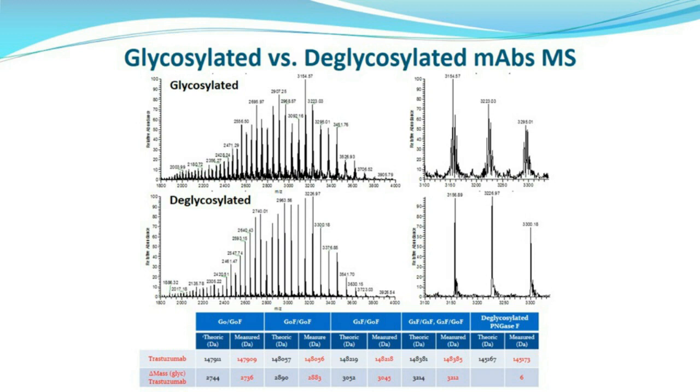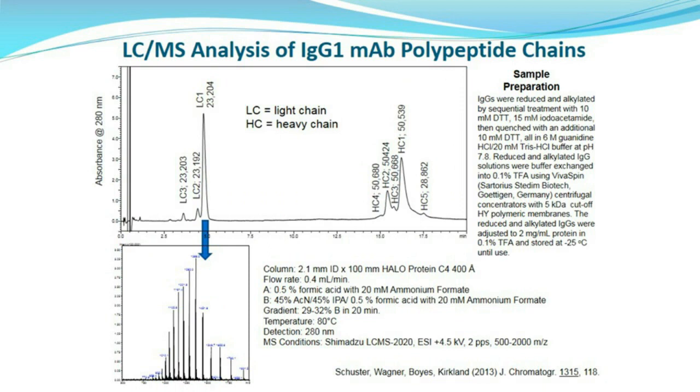Just want to quickly indicate that even though we've really focused on the use of this for peptide analyses and intact IgGs, of course exactly the same alternatives or features in terms of mobile phase modifications can be applied at different levels of protein structure determination.